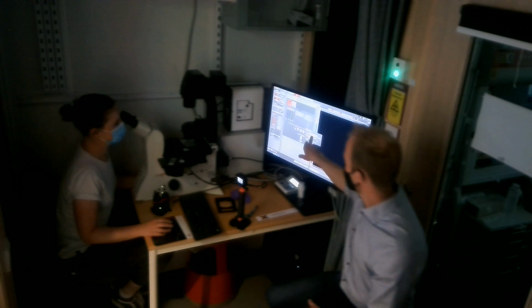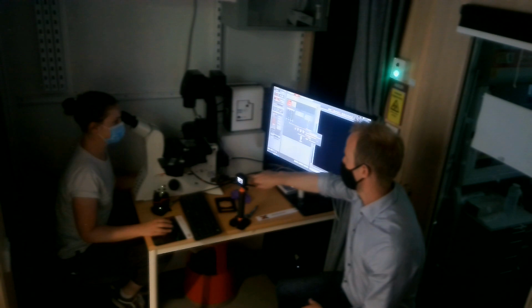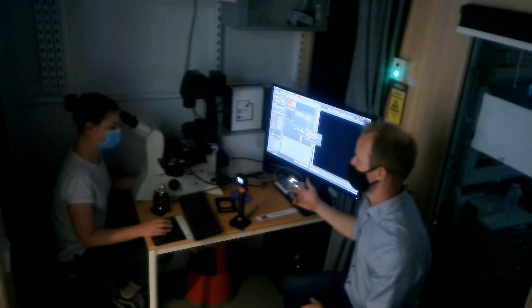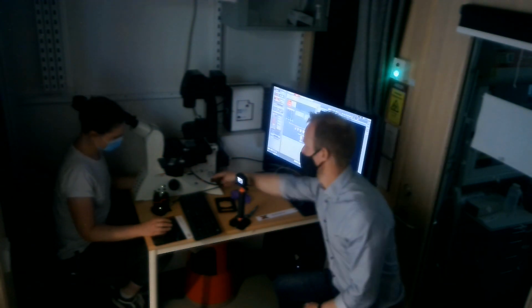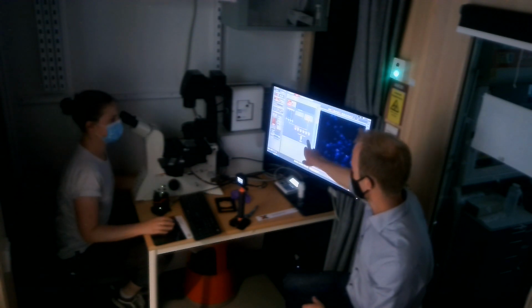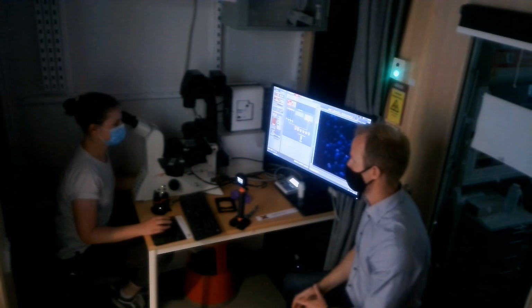So this one is simply telling you that a manual operation is needed, because if you want to see live, you need to have the camera option, so that it goes to camera and not eyepieces. So if you pull that out now, this one automatically goes away, because now it senses that yes, it goes to the camera. It's all good.